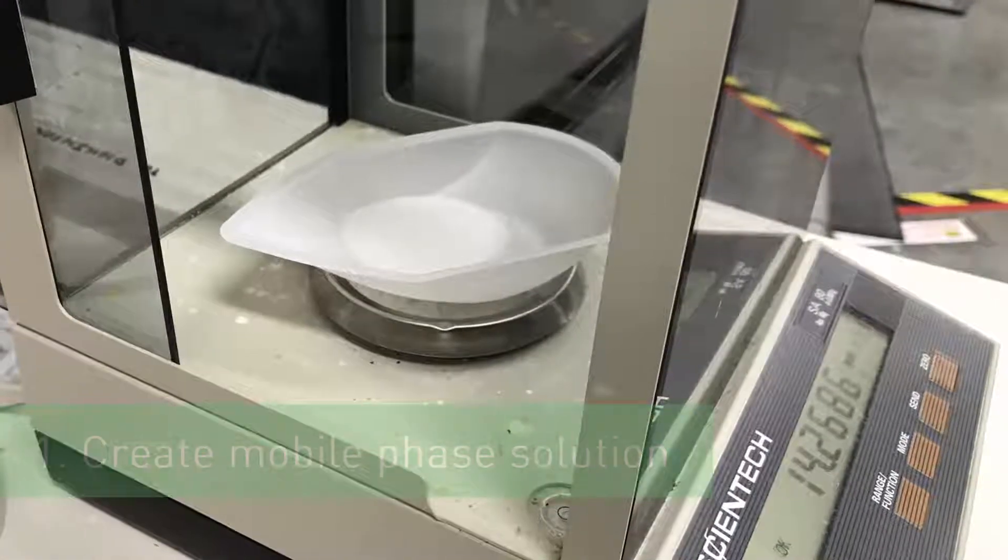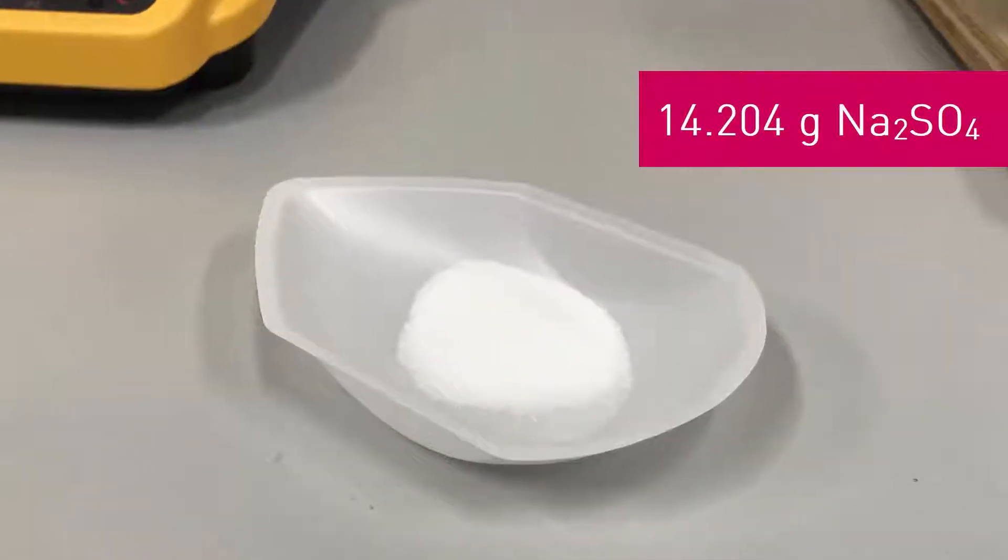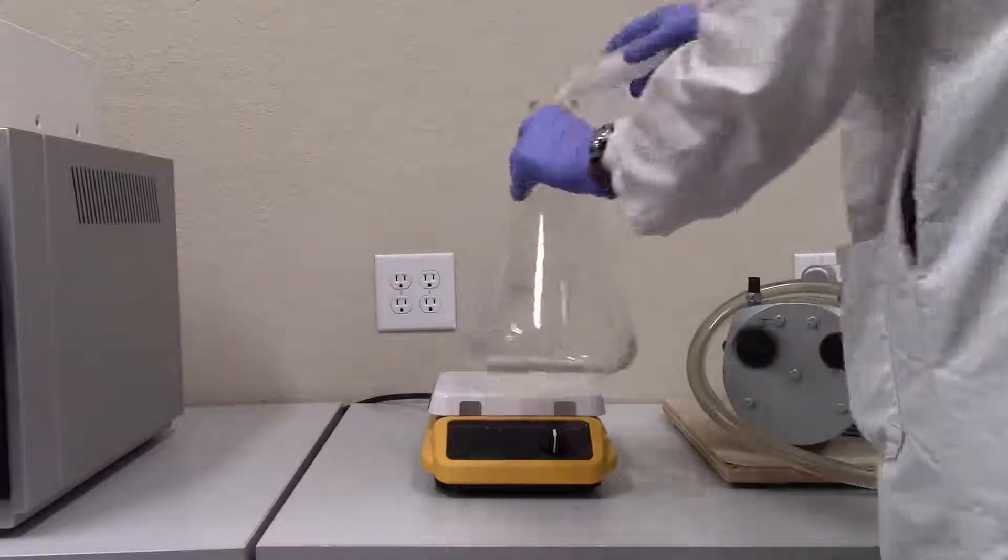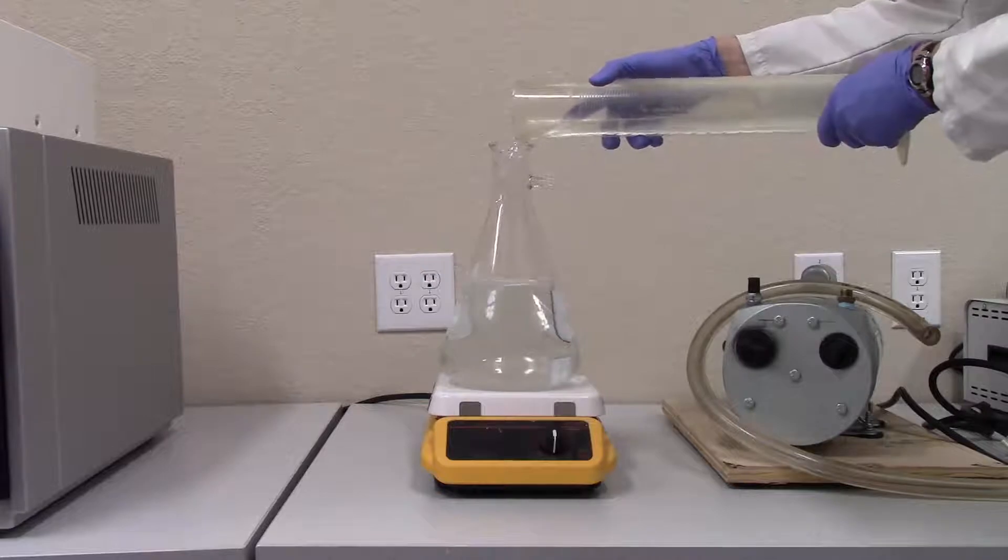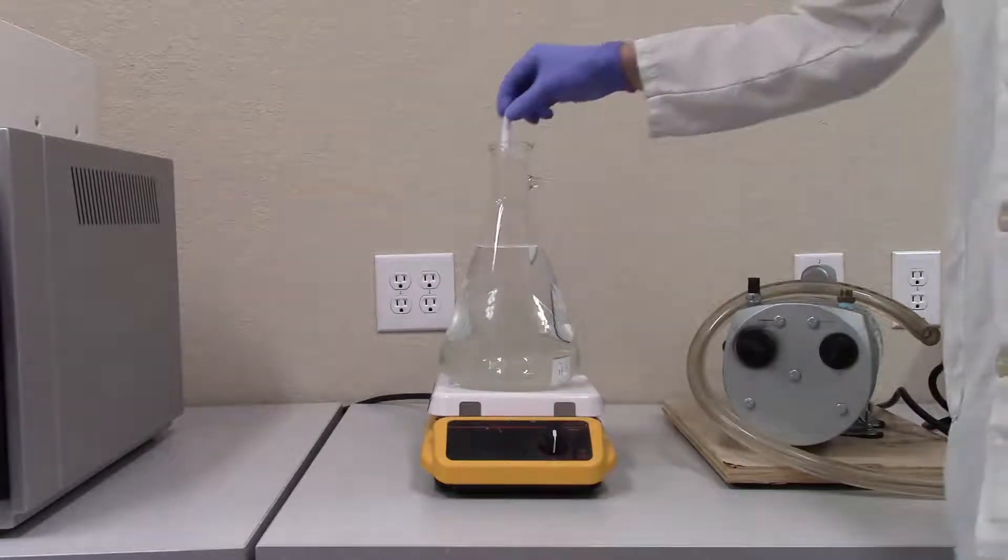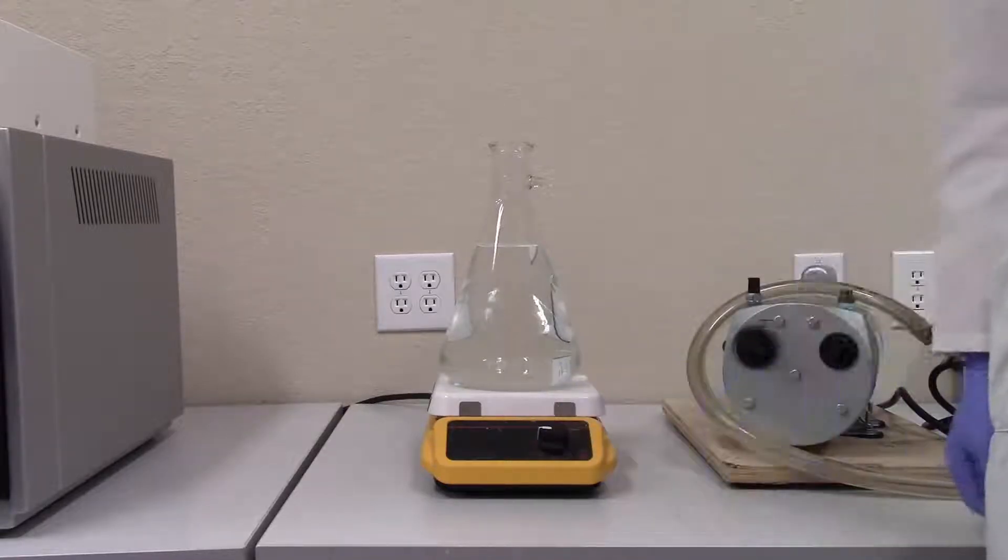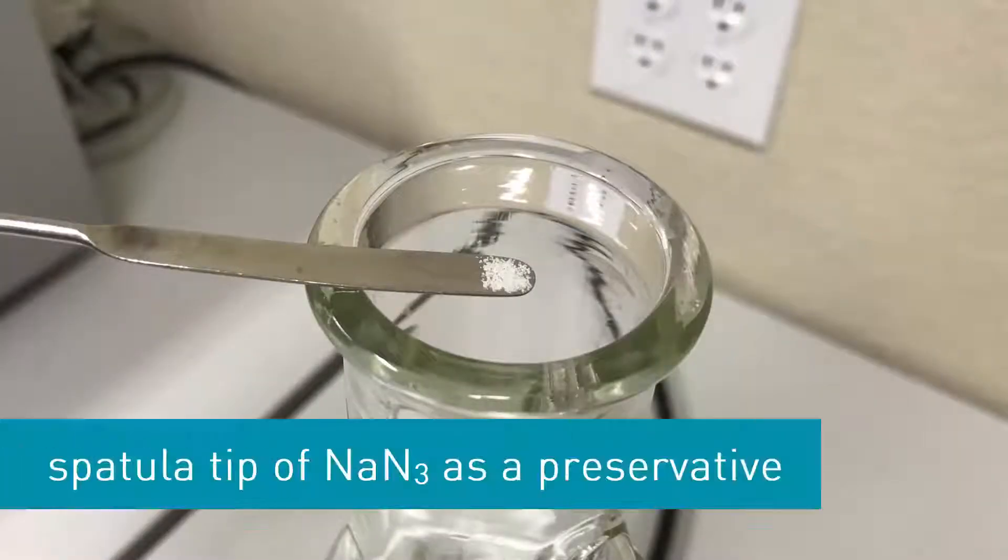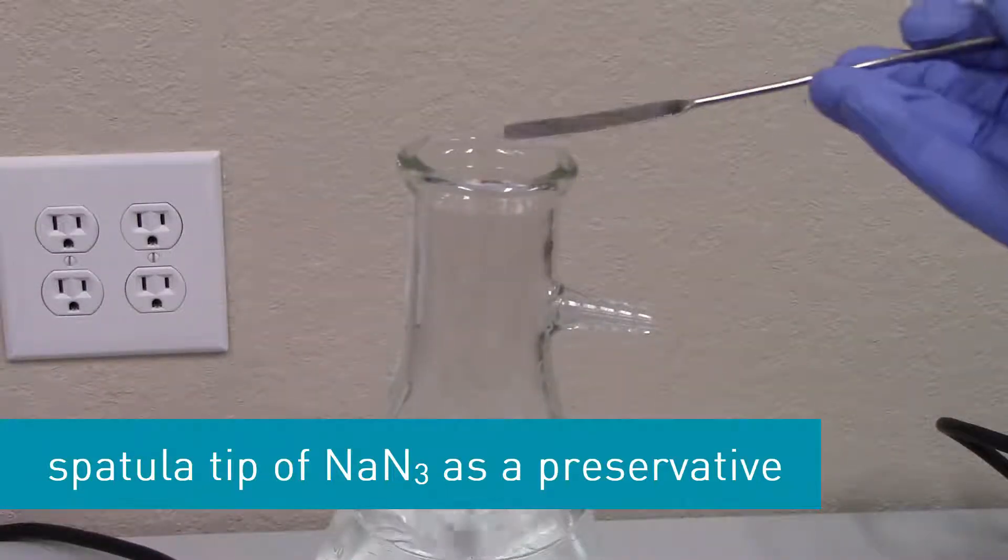I've pre-weighed the appropriate amount of sodium sulfate to generate 2 liters of a 0.05 molar solution. I'll add that to my mixing flask, add 2 liters of distilled or deionized water, and then let the solution stir gently to completely dissolve. Since this is an aqueous mobile phase, I will also add a spatula tip of sodium azide to act as a preservative.